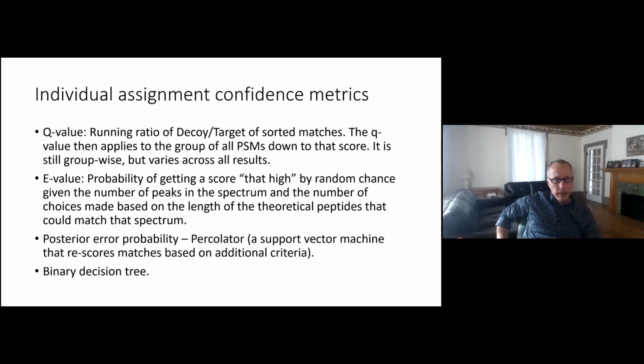The reason is that when you're picking peaks at random, the peak distribution doesn't really match that of a natural peptide. I talked about that earlier, the importance of a decoy. The decoy really has to look like a target, with respect to Mother Nature. Otherwise, it's not going to be a very good benchmark to match against. With the E value, just choosing M/Zs at random from all possible M/Zs, you're creating lists of M/Zs which never would occur in nature. And so I feel like it's under-reporting the confidence.